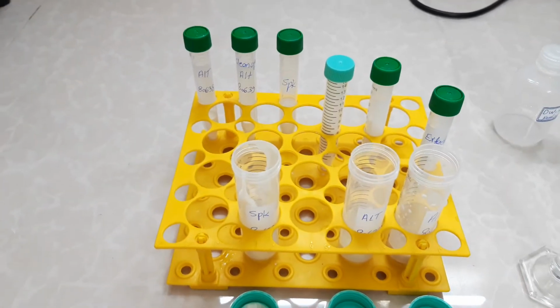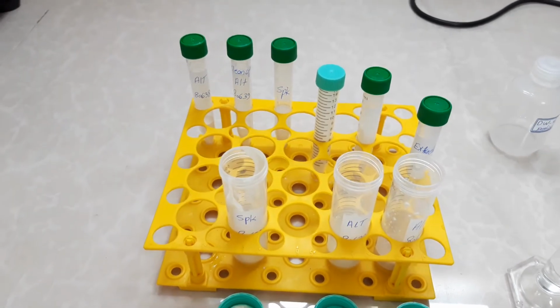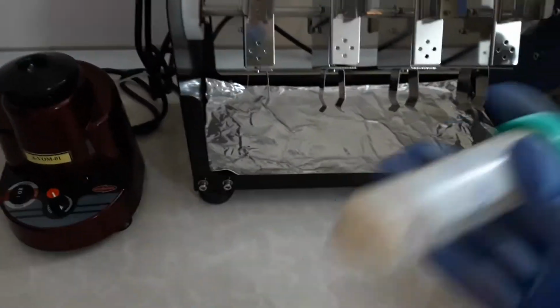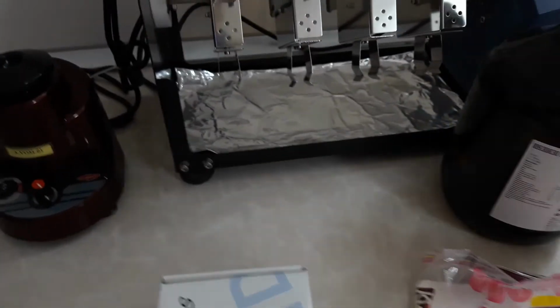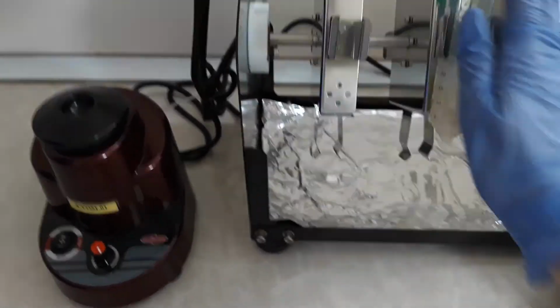Okay, in this step we add acetonitrile as an extraction solvent, close the cap and shake it by hand first, and then put it in the shaker.